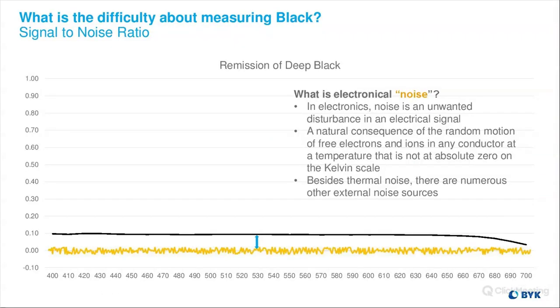So in addition to those new indices, we have another problem, which is instrument noise and electronic noise. That's inherent with every type of electronics that are developed, made and used: you're going to have some type of electrical noise. And the problem with color measurement, especially with these deep blacks, is that once you get so deep into zero reflectance, you can see this.